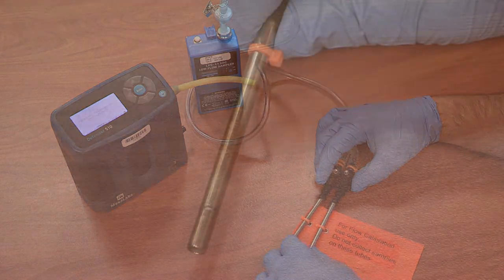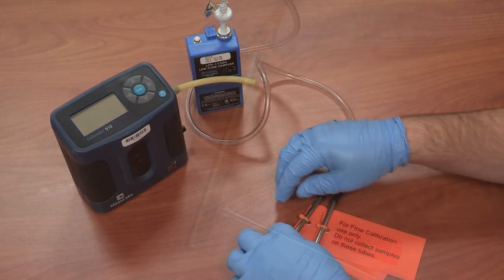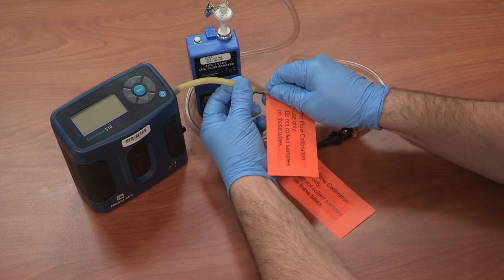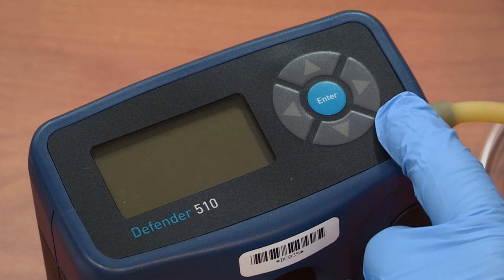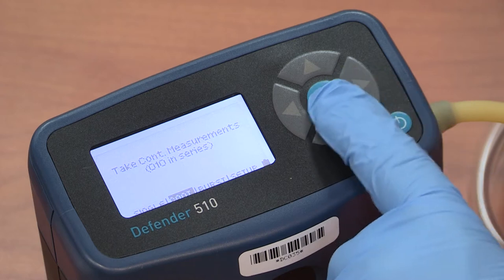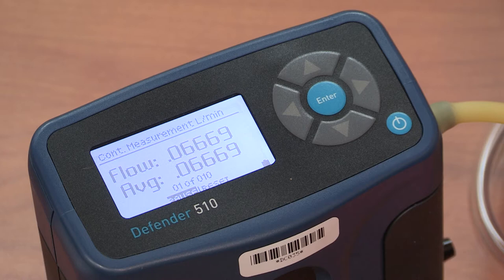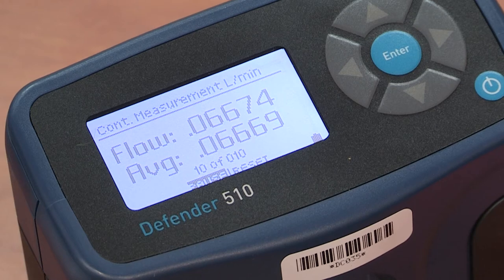Begin by connecting the calibration tubes to your dual split tubing. The grooved end of the tube must face away from the pump. After the calibration tubes are connected to the pump tubing, connect the open end of the thermal desorption tube to the tubing adapter of the calibrator. Turn on the calibrator and allow it to run for a rotation of ten readings.